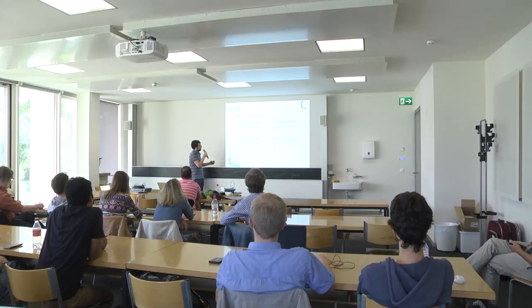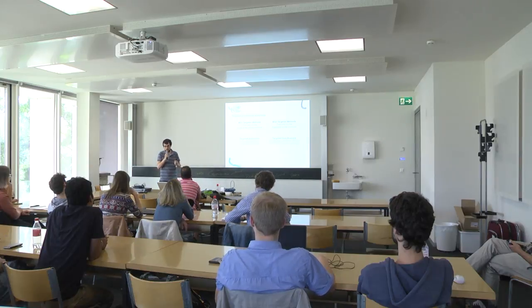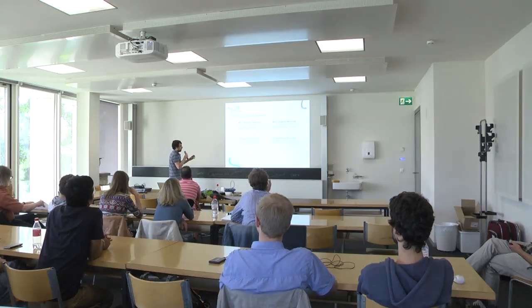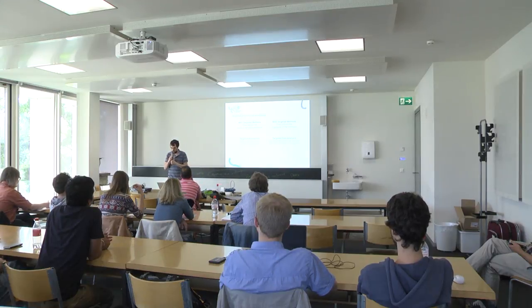I separate it into MS1 level and MS2 level. So this would be one classification, whether it's targeted at the MS1 level or whether it's targeted or untargeted at the MS2 level. And then whether I'm doing targeted acquisition or targeted data analysis, as was pointed out before.